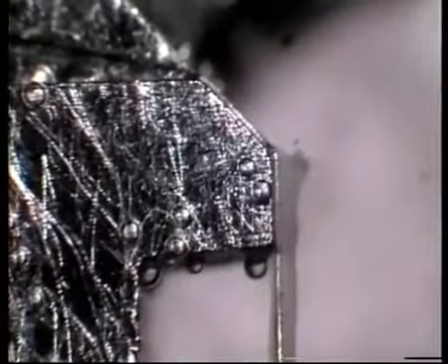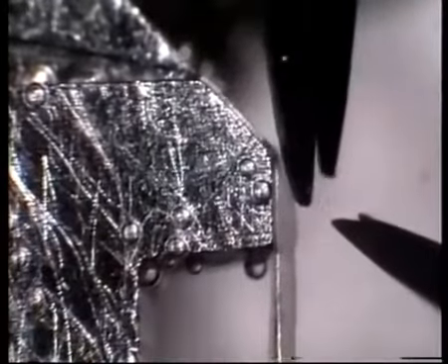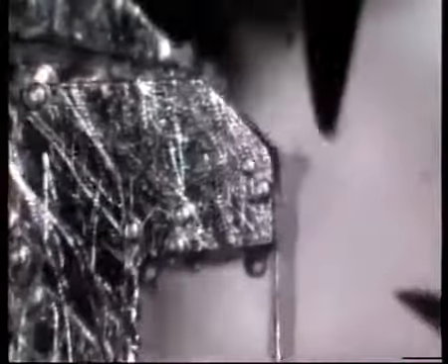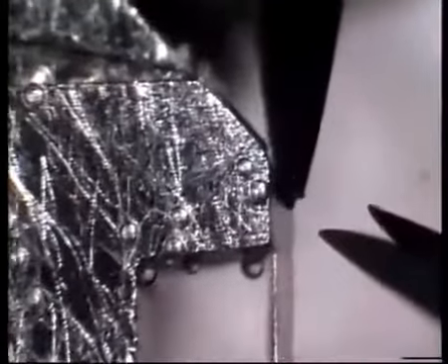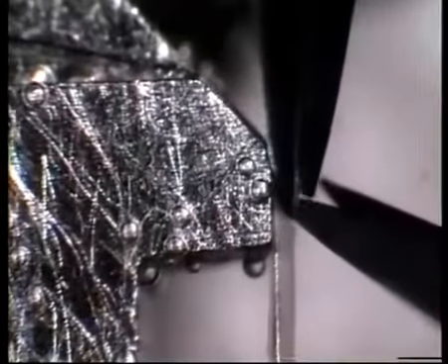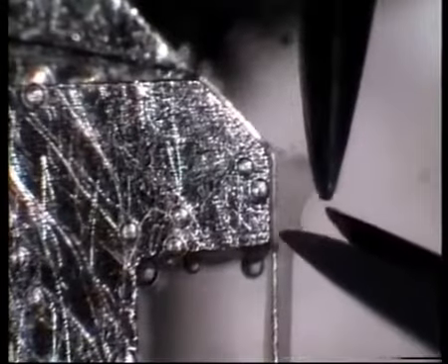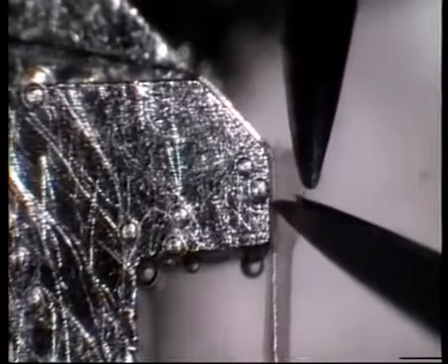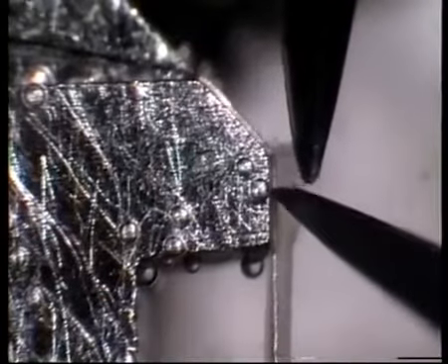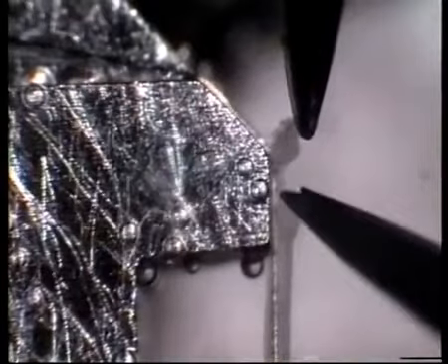Here the second method for removing excess vessel is shown. You should imagine that the bigger vessels were still here. These will now be cut away instead of rubbed apart. The myograph heads are widely apart and you use a large microscope magnification. With the forceps and scissors, you carefully hold the vessel, pull it in the horizontal plane and make small cuts in the vessel until it is freed.